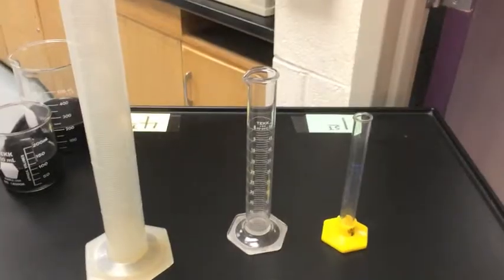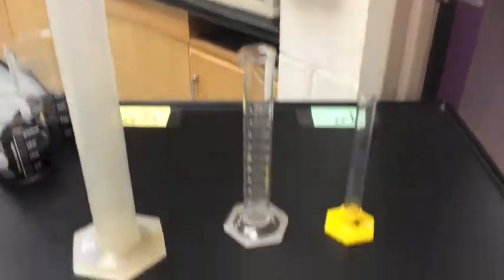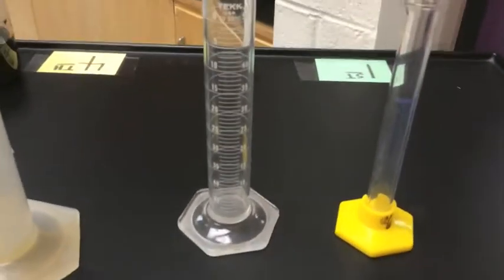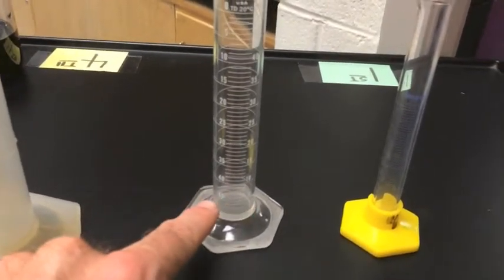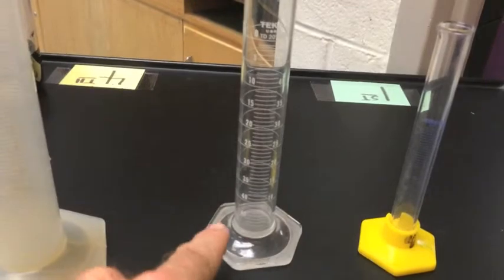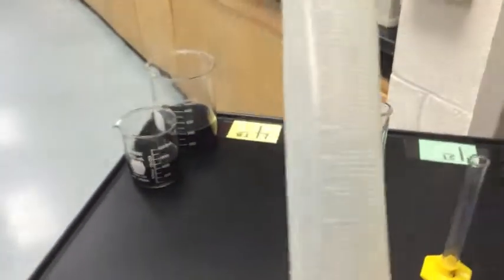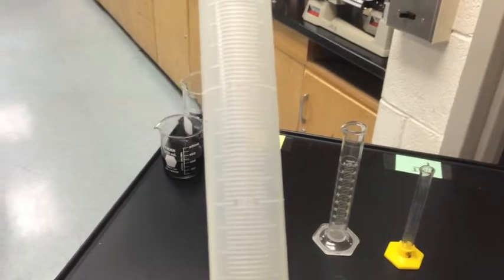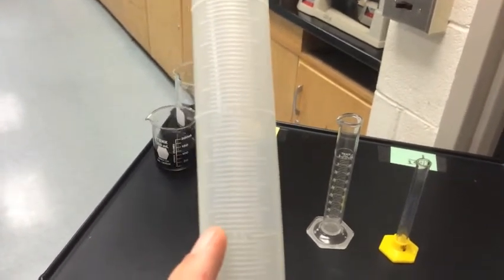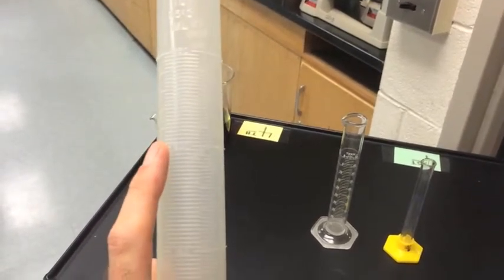To measure something with a greater degree of accuracy, you need graduated cylinders. Remember, graduated cylinders have the graduations on the side. You're going to remember that this one has the same numbers, some going down from the top and the other side going up. We're going to use the numbers going up. This graduated cylinder measures with its graduations. Hopefully we can see this, but I'll identify it if it's a problem. We have 150 right here, all the way up to 200 up here.